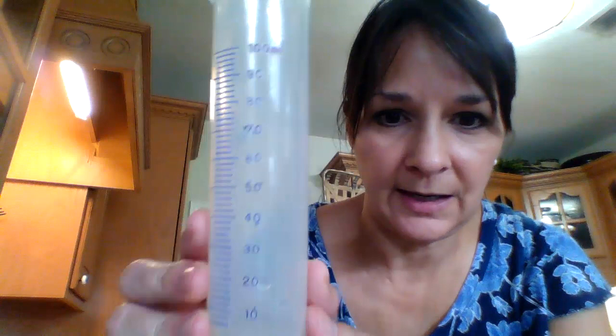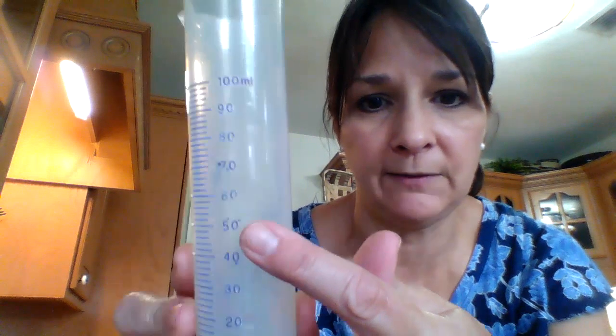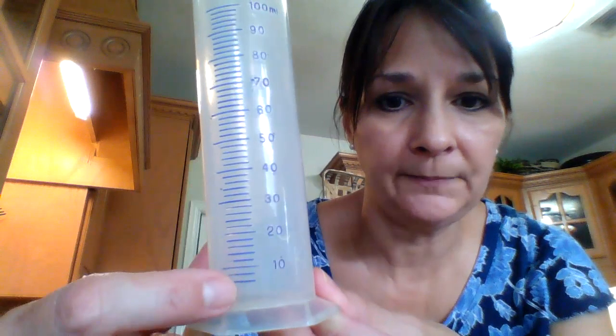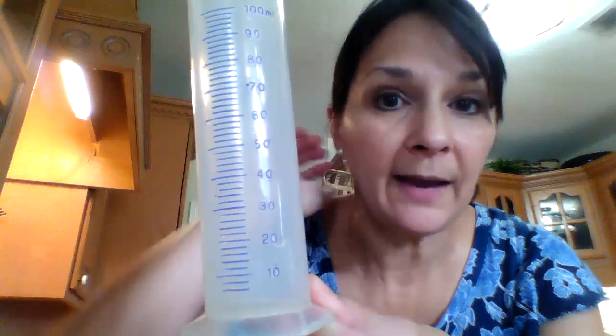Now the first thing I want us to look at is the numbers on the graduated cylinder. How are those numbers counting? Well, we've got 10, 20, 30, 40, 50, and so on. So yes, those numbers are counting by tens. However, look at the lines, okay? There are lines in between the tens. So what we have to do first is determine what each of those lines are counting by, okay?